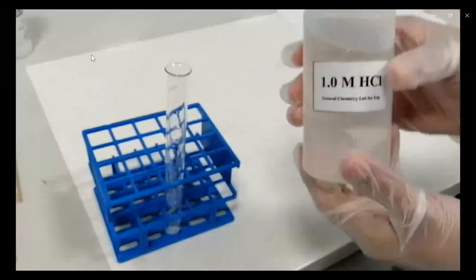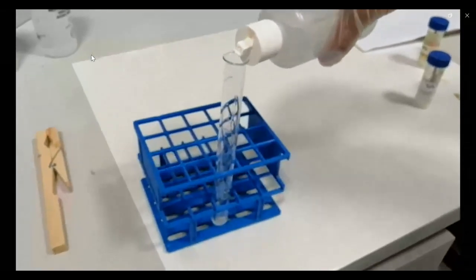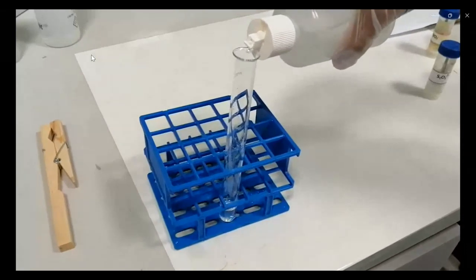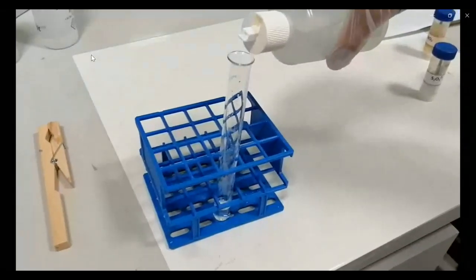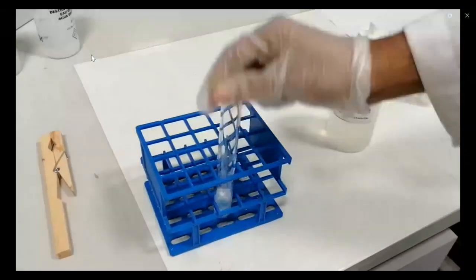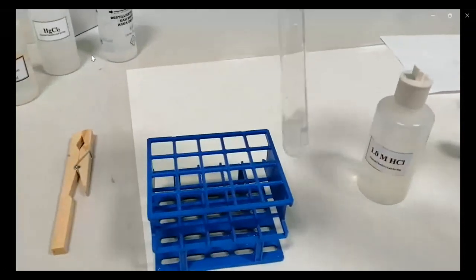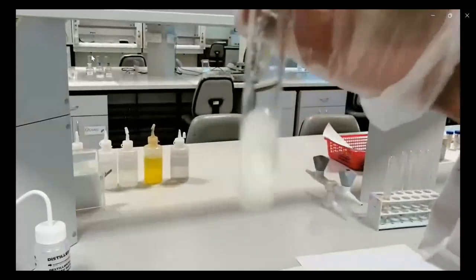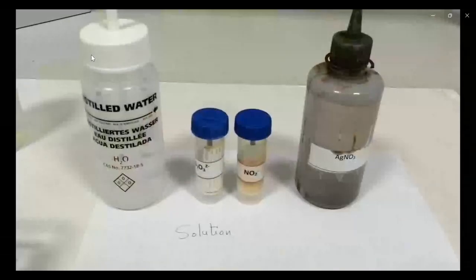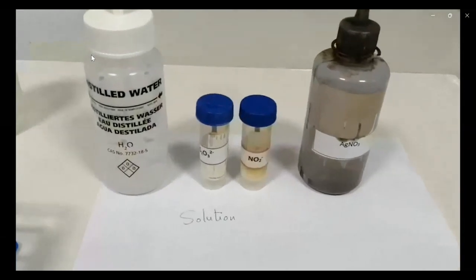For thiosulfate, the reaction is not so strong like previously, but a suffocating odor gas is evolved, which is SO2. And you will see the solution becomes pale yellow or turbid after shaking. We have a very bad suffocating odor. Now we are going to the confirmation tests.